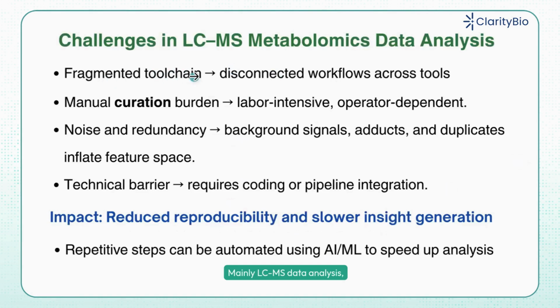Mainly, LCMS data analysis, metabolomics data analysis is usually a cumbersome task. The tools that are used, I have seen the guidelines or the blogs experts have written, where typically 4 to 6 different softwares are used, and one has to transport data from one software to another. Because there is a lot of noise and uncertainty, the data needs curation.